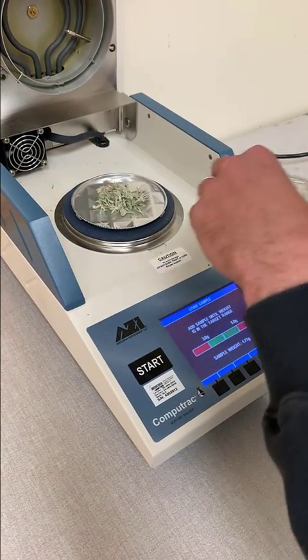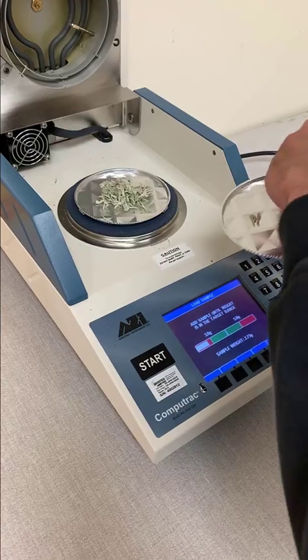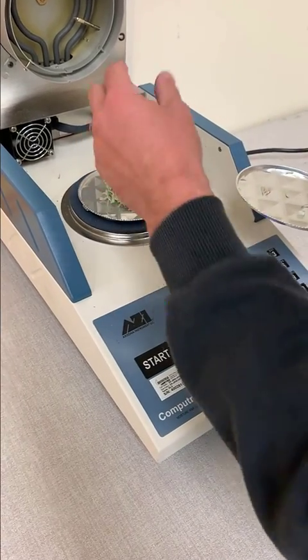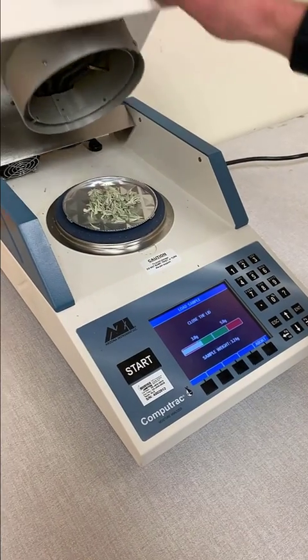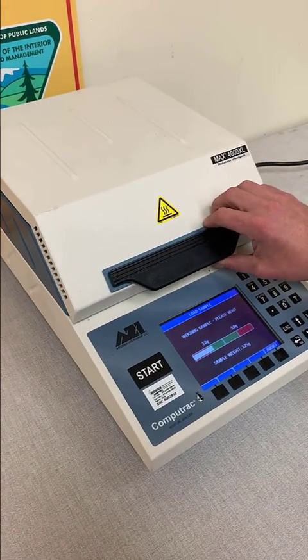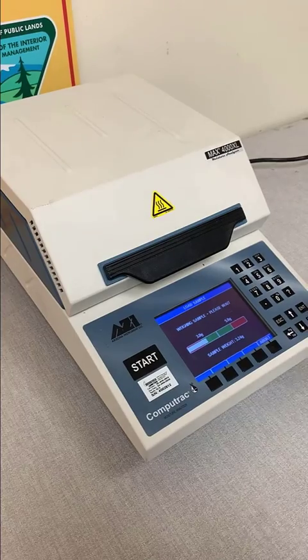As you can see, it's weighing out, and it will let you know when you hit it. So we are just over three grams. At this point, all we do is close the lid and let the machine work.